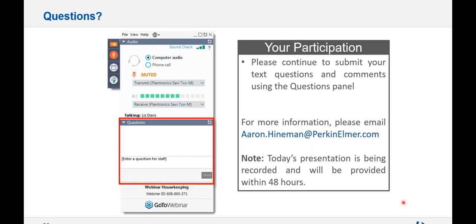New auto sampler cups need to be wash soaked in nitric overnight before using them. Yes, it's always good to soak your auto sampler cups. Again, we're dealing with very small aliquots of sample, so any contamination will be magnified with graphite furnace if those cups are contaminated. So make sure they're clean, whatever source they're coming from. At the very least, you need to rinse them out a few times with whatever you're putting into the cup, but it's best if you can soak them in 10% nitric overnight.